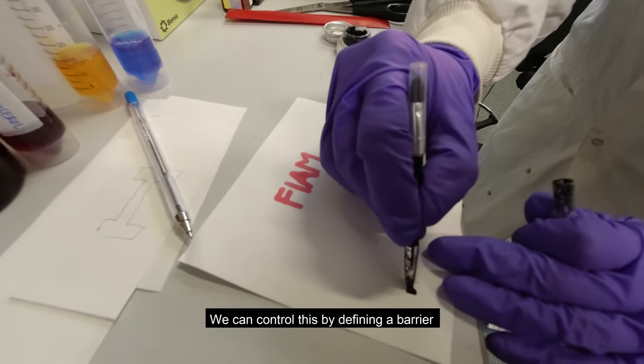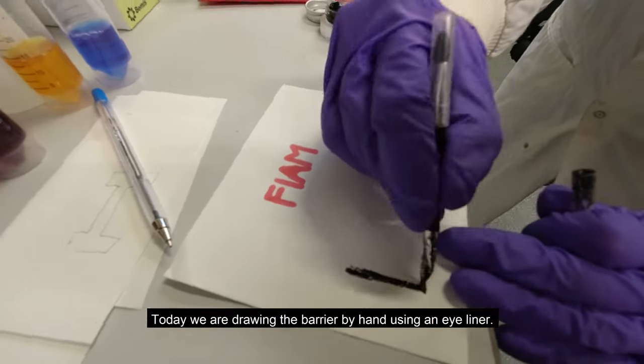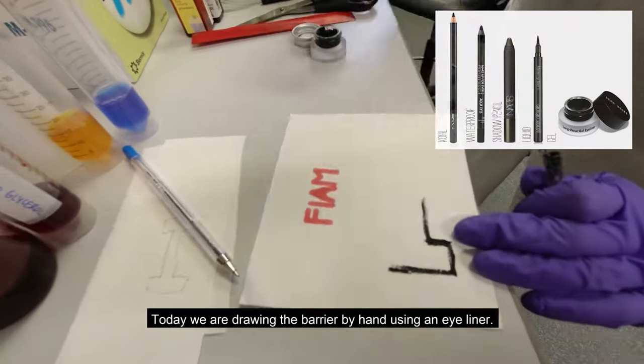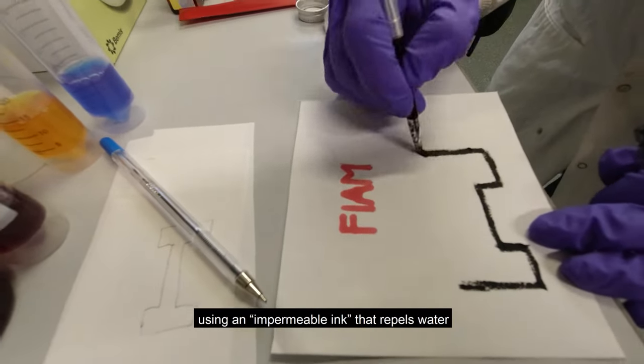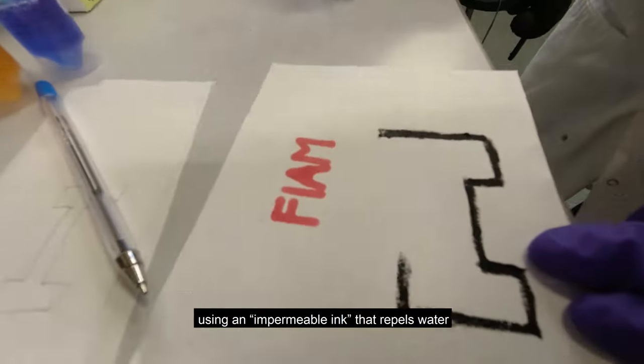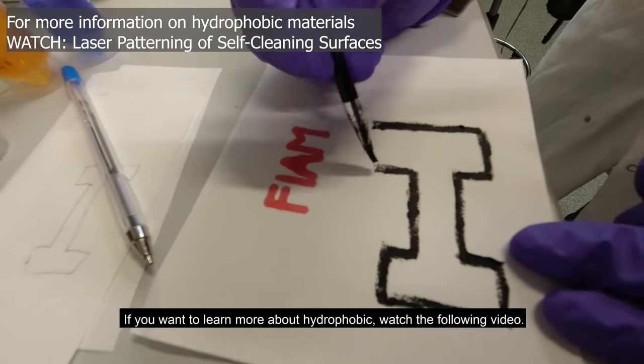We can control this by defining a barrier that blocks the flow of liquid. Today we are drawing the barrier by hand using an eyeliner. We could also use the robot to print this barrier using impermeable ink that repels water. This is called hydrophobic. If you want to learn more about hydrophobic, watch the following video.